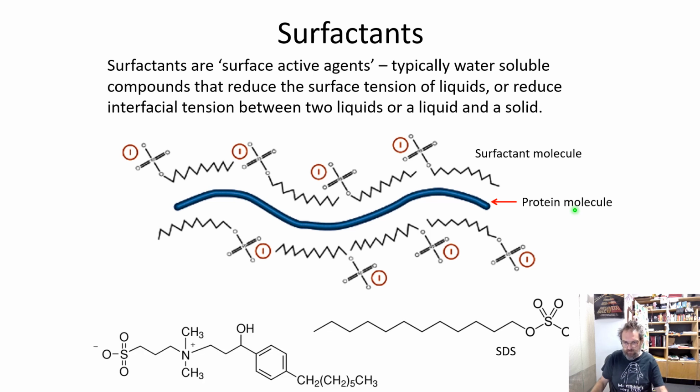The other kinds of surfactants are what's called zwitterionic surfactants, where they are both positively and negatively charged in solution, but the overall charge on this molecule is 0. So when you put these into an electric field, they don't move. They can coat the protein through these hydrophobic regions. This is a surfactant called C7BZO. Again, you have the hydrophobic tail that interacts with the protein, and you have this head group, which can then interact with water through the positive and the negative charge.